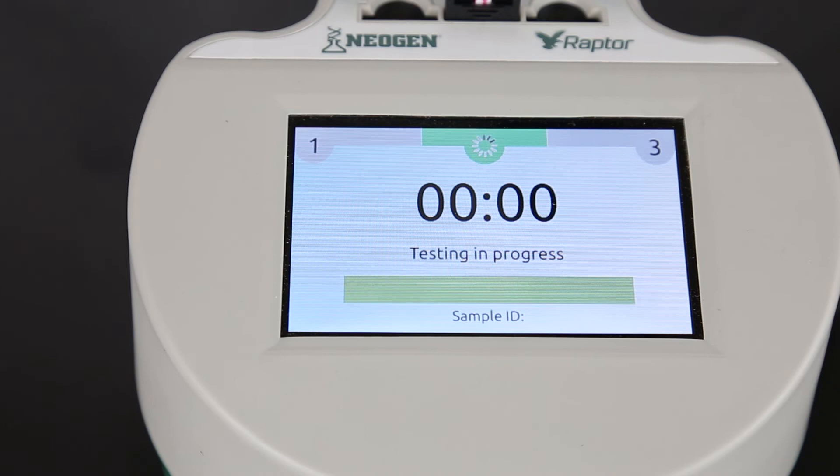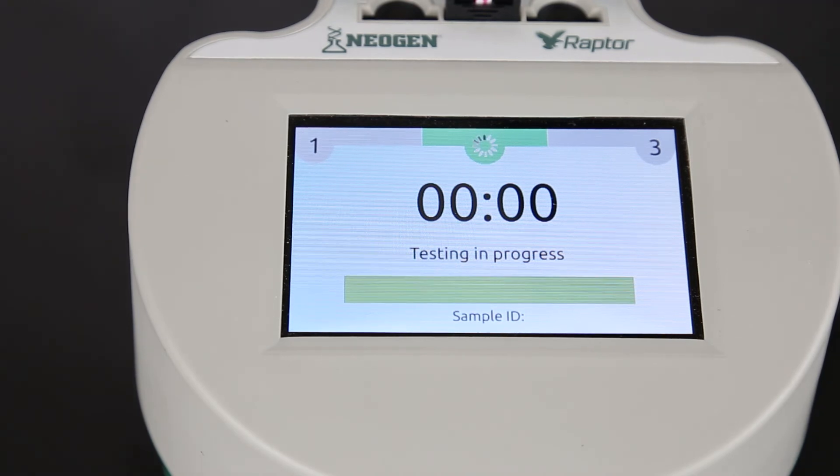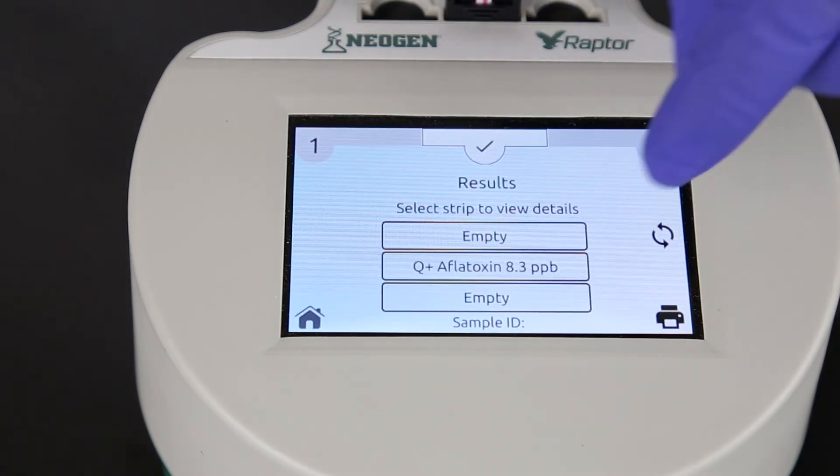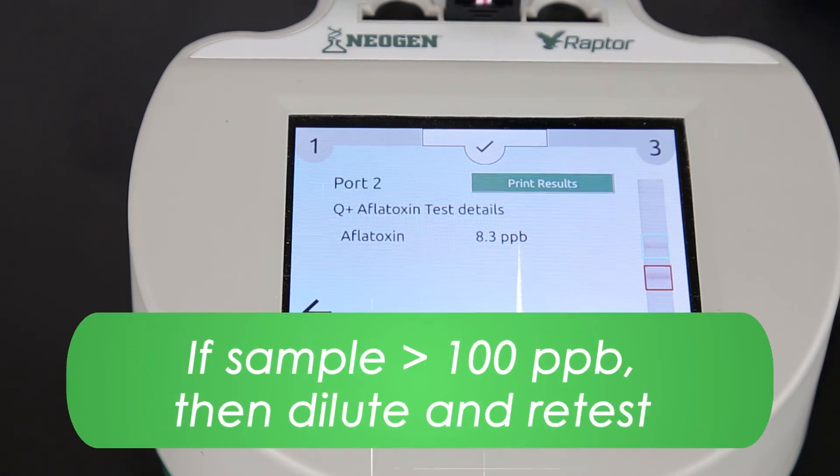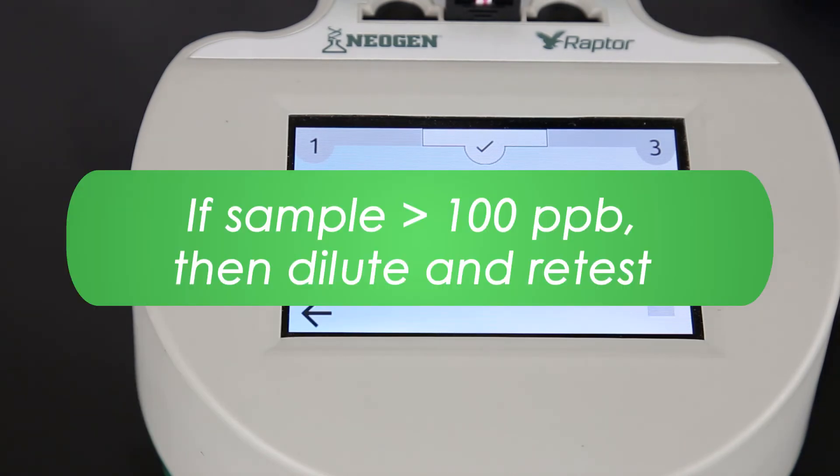After the six-minute testing time, the Raptor displays your results. For samples greater than 100 ppb, you will need to dilute and retest.